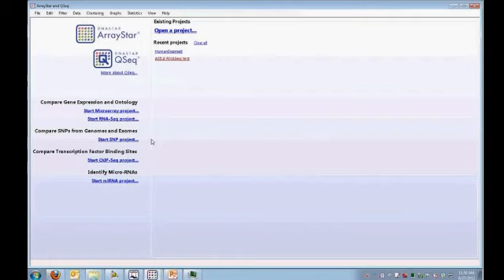So if you're using all open source tools and you have a variety of projects, you may have to master a number of fairly difficult to use Linux algorithms. And that becomes a very difficult task. Whereas with SeqMan Engine, the algorithm will flex. It accommodates a wide variety of different types of projects and platforms. So it's a lot easier to use in that sense. Engine also produces better results than most of the open source algorithms. So you'll get better de novo assemblies that are more accurate.